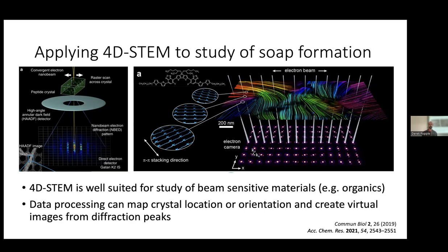So it's incredibly powerful. I guess, unfortunately, because it's four-dimensional, you also collect pretty large data sets. So we do relatively small acquisitions, where the scan is about 40 by 40 pixels, and it's 800 megs of data. It's common to do a 500 by 500 pixel scan. So you're getting to 80 or 100 gigabytes for a single image. So they have a lot of work that goes on at the National Lab as well, that's just focusing on how to work with that much data. And in some cases, when you work with the nice microscopes, they have a fiber optic cable that goes straight to the supercomputer to help parse the data and make it small enough to work with. But that's not the focus of the talk. We'll get back to the oil paints.